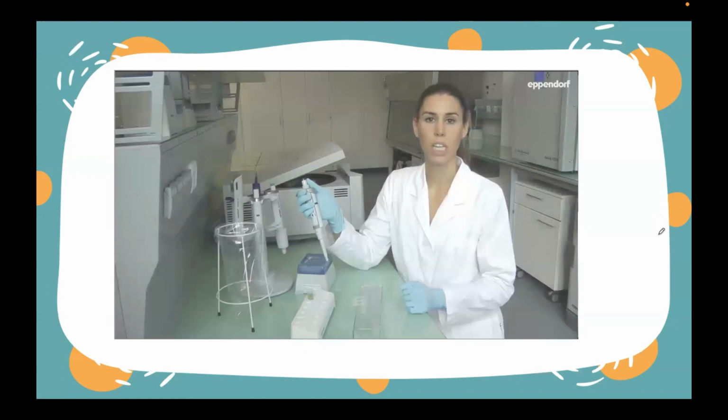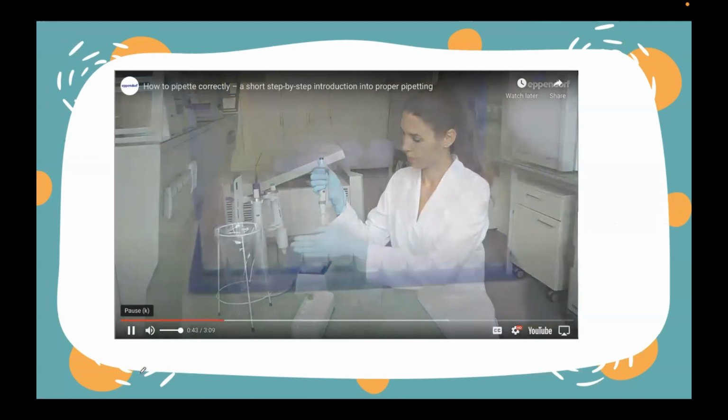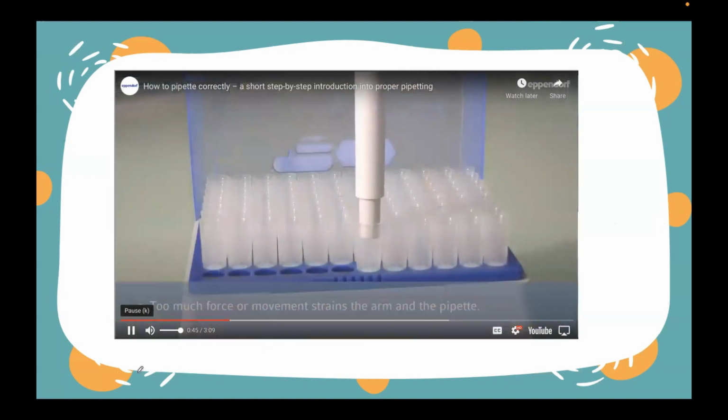Pipetting starts when you attach the tip. Apply light pressure to insert the pipette into the tip. There is no need for force or moving from side to side. Ayan. So once po na ilagay nyo na yung pinaka-pipette, micropipette ninyo doon sa pinakalagayan natin or nakapag-attach ka na ng pipette tip, hindi naman po kailangan na itaktak pa or i-press ng masyadong madiin. Light pressure lang kasi fit naman sila to one another.